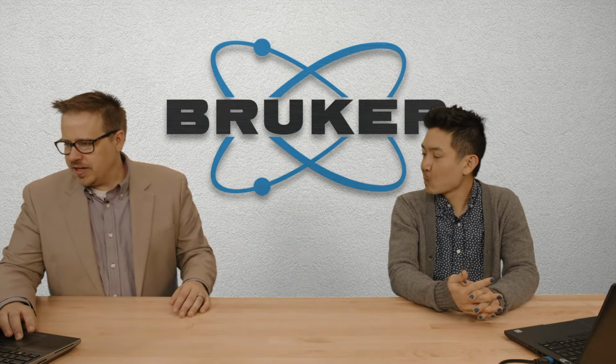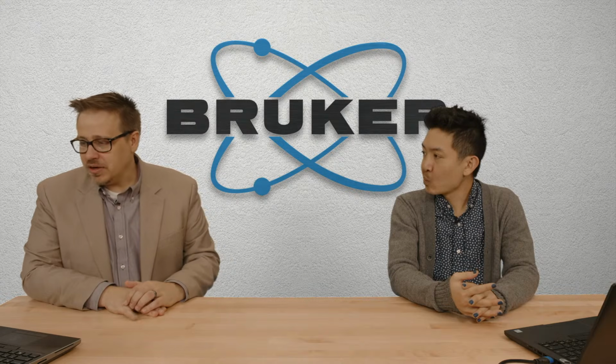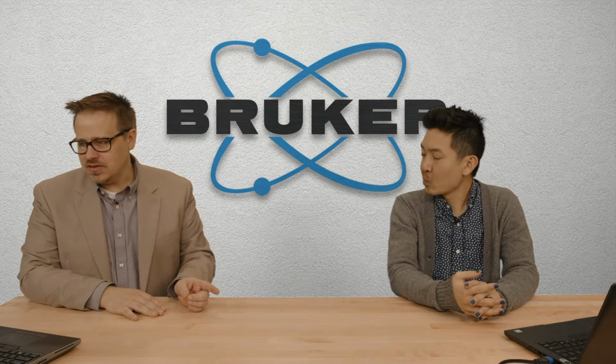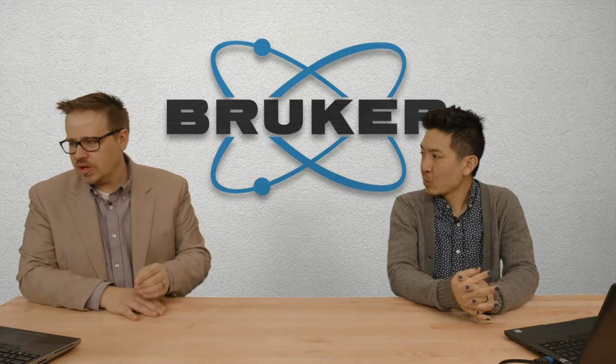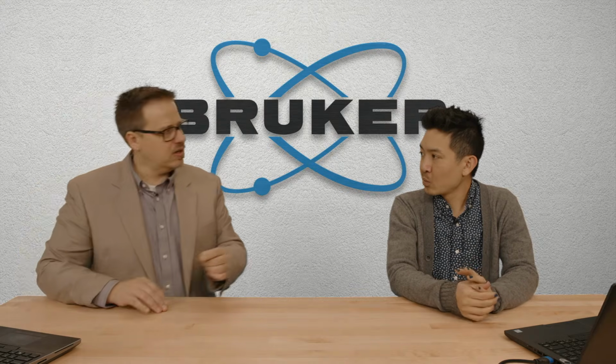So for the semi-quantification using EVA, what would be a better approach? Compare intensities of the most intensive peak, as you explained, or calculate the area using the peak fit option and compare areas? Oh, we were getting into an entire episode of quantification, right? Yeah. So it all depends on which methodology you want to employ.